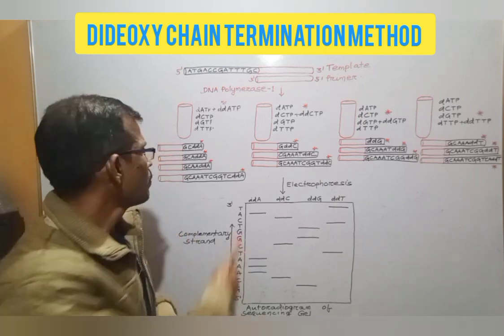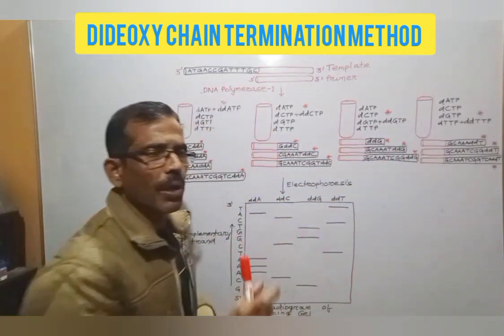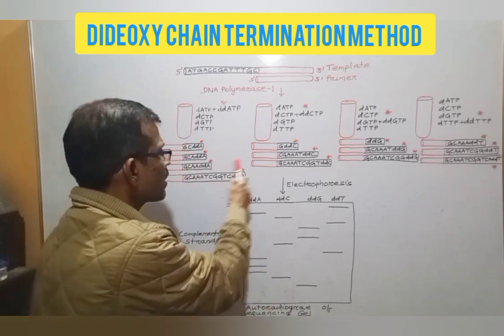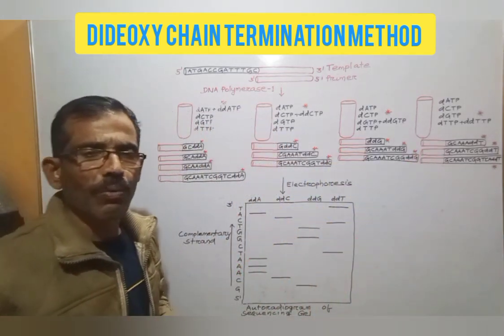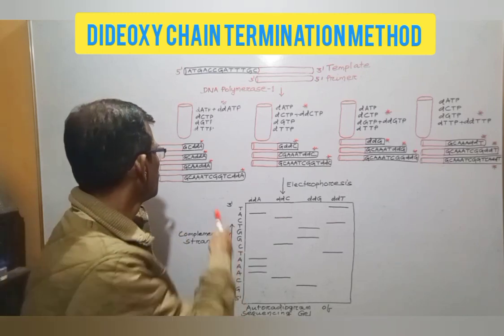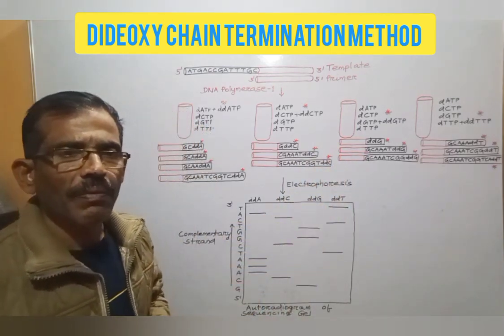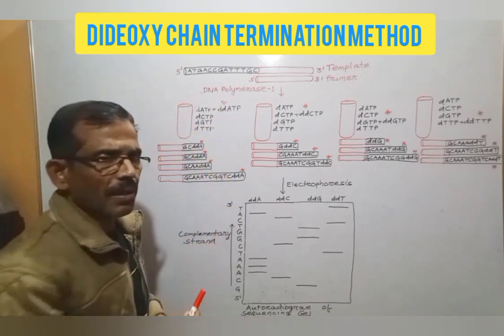After this, replication is carried out in 4 different batches by employing DNA polymerase 1 and the same standard primer. These red colored strands are the DNA primer, whose function is to provide a free 3' hydroxyl group to which nucleotides are added by DNA polymerase 1. Let us discuss the fragments that are obtained from batch 1 chemical reaction.